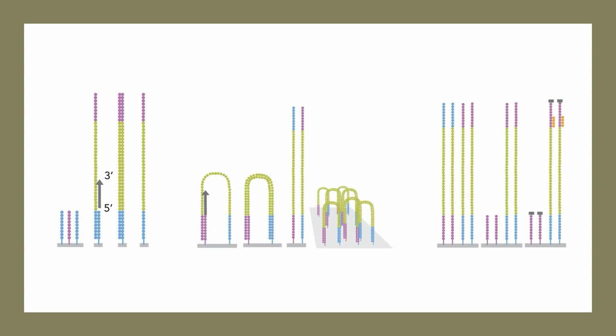Our data was generated by Illumina's NextSeq 550. These sequencers have oligonucleotides covalently bound to a flow cell in the sequencer. During DNA library preparation, complementary oligonucleotides are ligated to the ends of the DNA fragments so that when they wash over the flow cell, they bind to the oligos on the flow cell through complementary base pairing. The oligos ligated onto the DNA fragments are called Illumina adapters, since they are required for the DNA libraries to be captured on the flow cell of the Illumina sequencer.